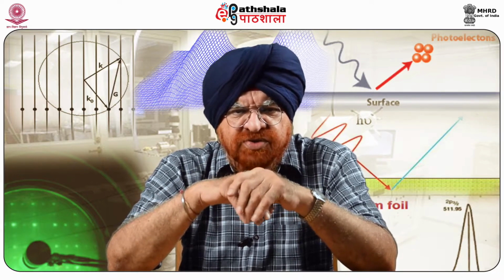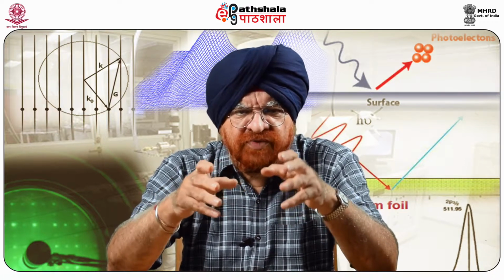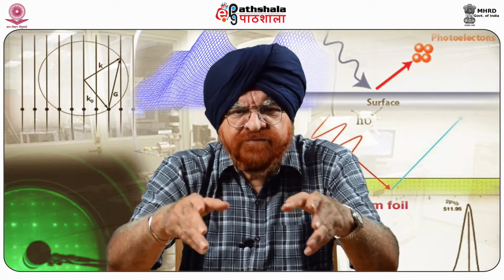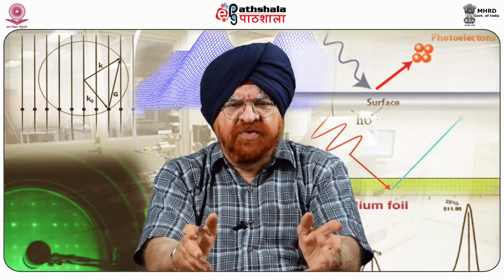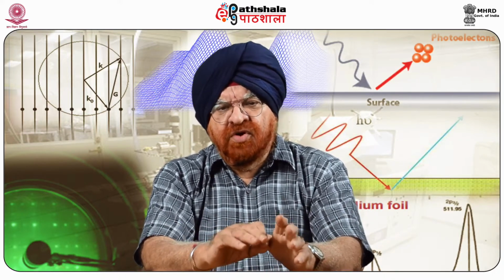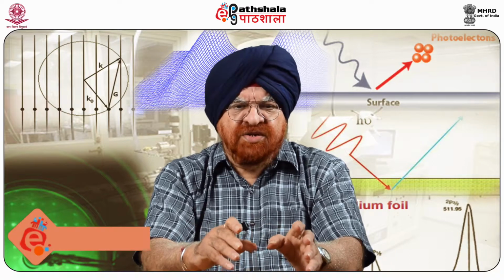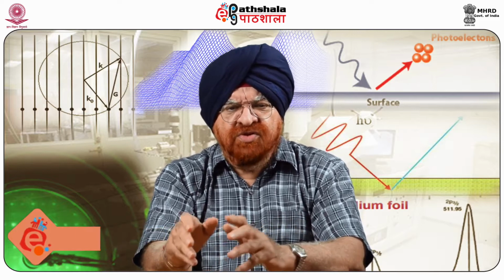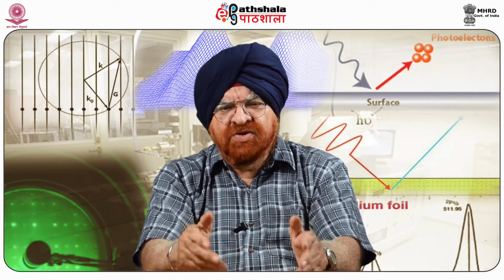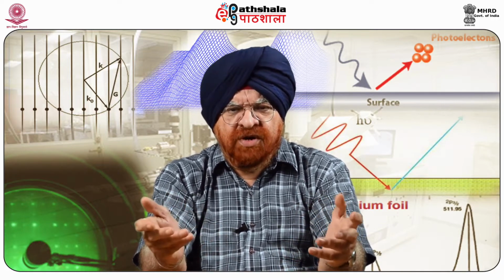CFM imaging of systems such as polymers, biomolecules, and other materials could produce direct images of the spatial distribution of functional groups, hydrophobic versus hydrophilic domains, and the time course of the surface reorganization. Therefore, in conjunction with the adhesion data, CFM can distinguish between functional group domains in organic and aqueous solvents. I hope you have understood the potential of CFM towards imaging various important areas of chemistry.